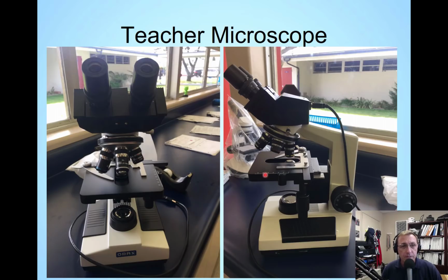All right, so this is the teacher microscope, our actual teacher microscope. See 2 pictures, one from the side here, and then one from, I guess, the front or the back. Anyways, this would be how you look at it. So you put both eyes on this one, which helps bring the image into focus. It's really fun if you get a chance to use this one. It's pretty awesome. But you do need to know how to use a microscope safely, because especially this one, which costs a few $100s, you can damage it or break it if you don't use it correctly.